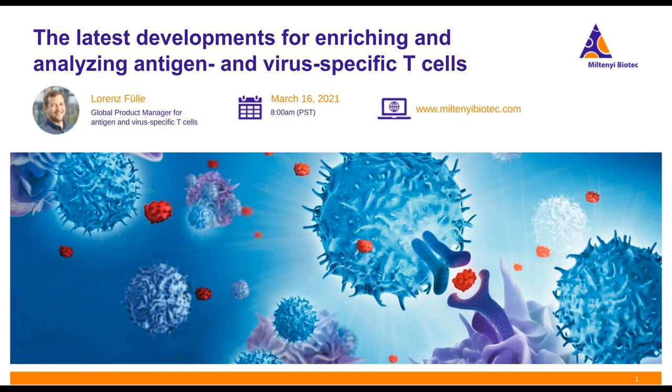Okay, great. What is the difference between the different spike protein peptivators? Yes, so this is also a very good question that we often get. So I can try and untangle that a bit for you. So first of all, these different spike protein peptivators cover different parts of the spike glycoprotein. So for example, the peptivator protein S covers all the predicted immunodominant domains of the spike protein.